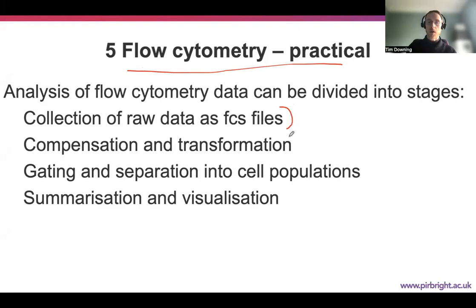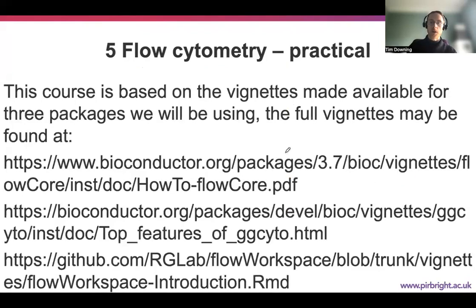We're going to compensate and transform that data appropriately based on what we visualize and see, and how we can therefore set it up for suitable gating and separation into cell populations, and then summarize and visualize it all together. We're going to note that the resources used to design this course are available in the introductory videos and in this video as well, and are listed here.